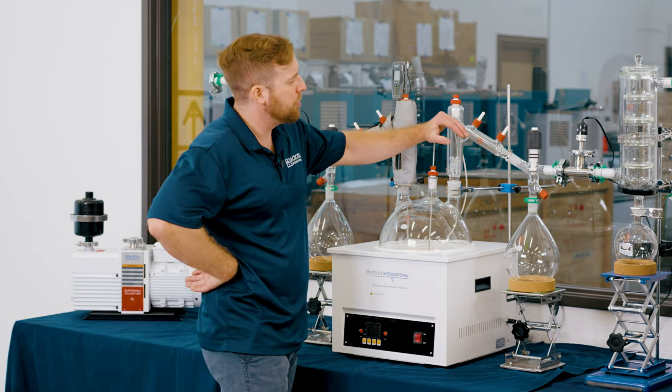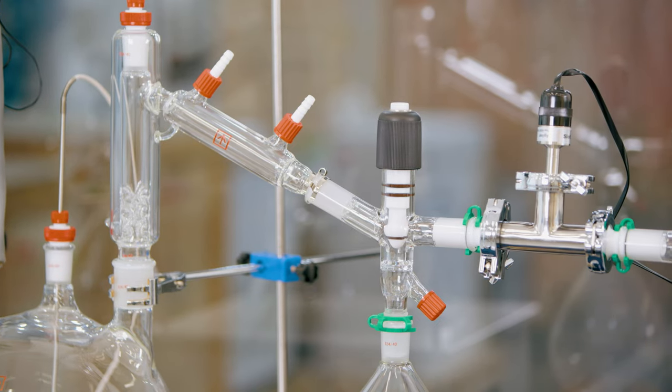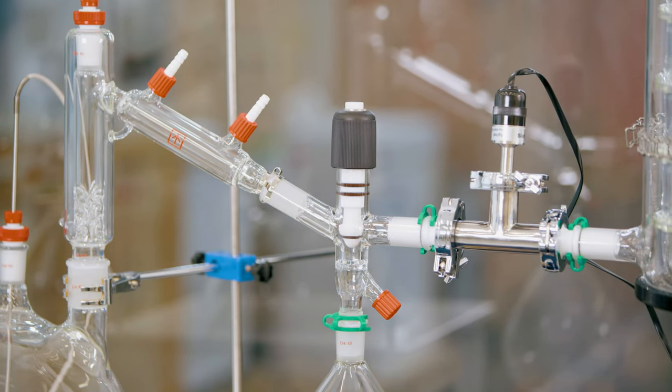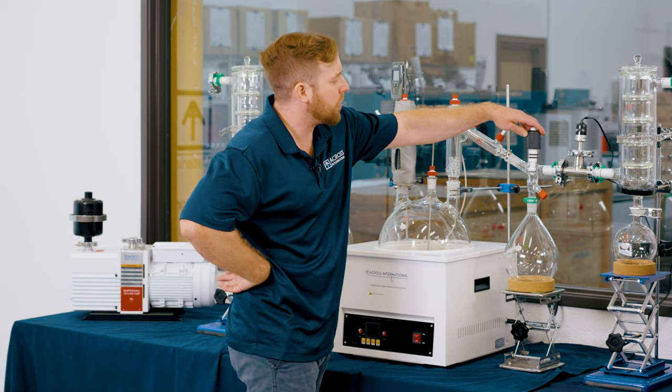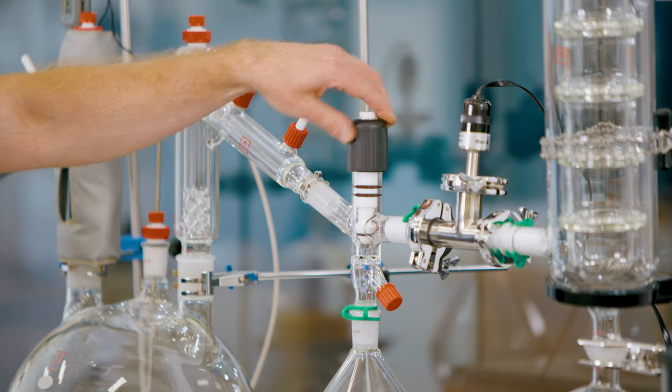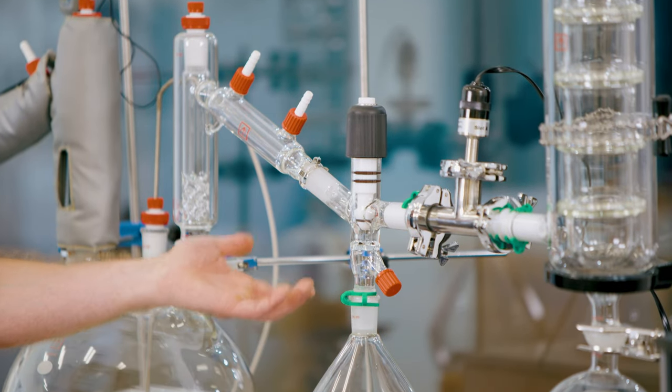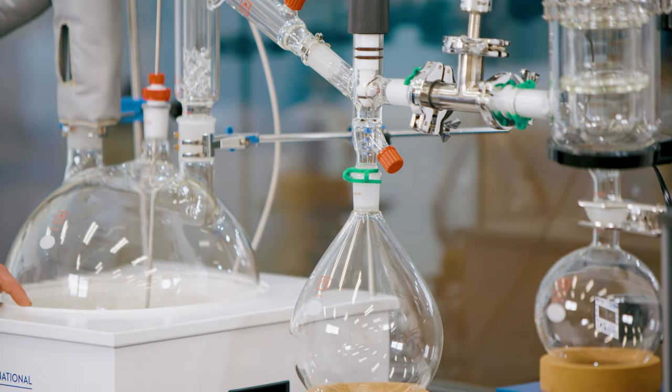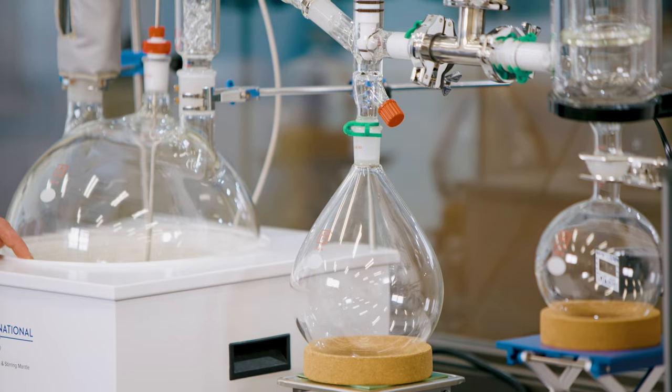From the distillation head, we move over to the Liebig condenser and then down to our mono cow and receiving flask. On the Across International system here, we're going to be able to isolate vacuum and remove this flask in order to swap out between fractions. This is going to give us a lot more functionality and versatility versus the traditional mono cow.